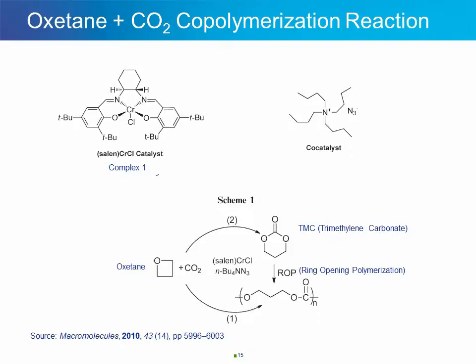An investigation of the nature of the catalytic species involved in the reaction was described. Additionally, the dependence of reaction temperature on the selectivity of the coupling of oxetane and CO2, as monitored under high pressure by in situ infrared spectroscopy, was presented. Finally, the effects of temperature and pressure on the selective synthesis of TMC from the coupling of oxetane and CO2 was also discussed in this paper.